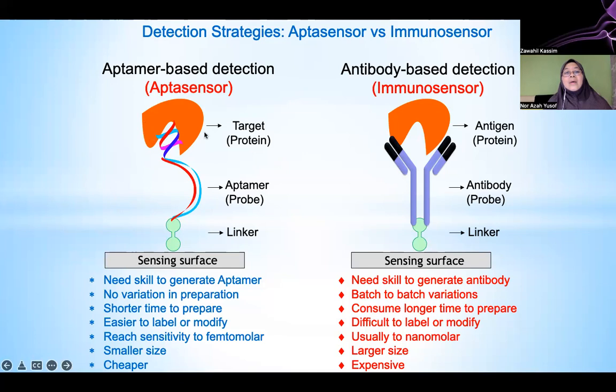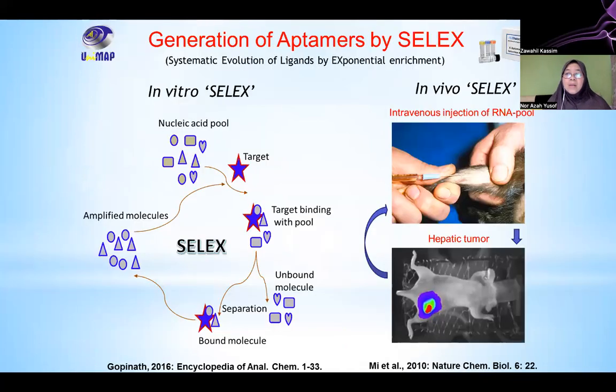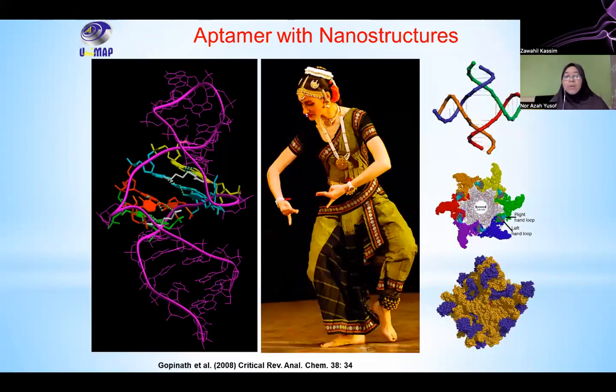Aptamer is much more robust. You can detect many different types of target or analyte. If you compare to DNA, it has to match with DNA from the species or the protein. But for aptamer, you can design it to match drugs, metabolites, proteins. So it's much more robust, and it's much more practical.